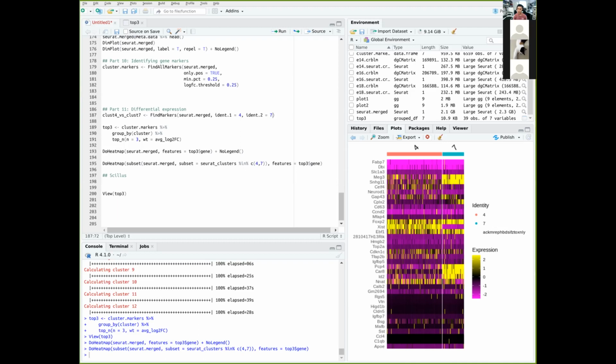You can do probabilistic assigning of cell identity. So instead of eyeballing the markers, you can look at all of these marker genes, put them into a machine learning model and get them to assign the cells for you. One that I use quite regularly is called CellAssign. It's pretty good actually.